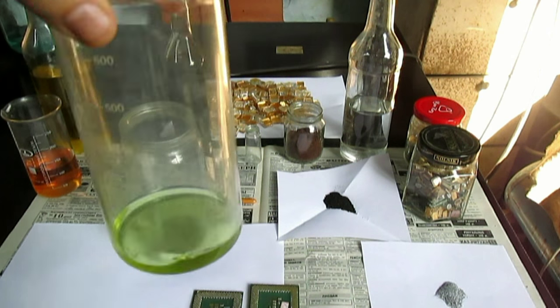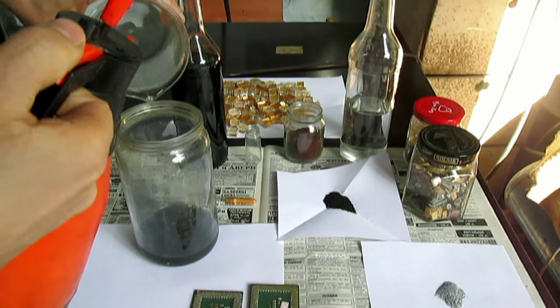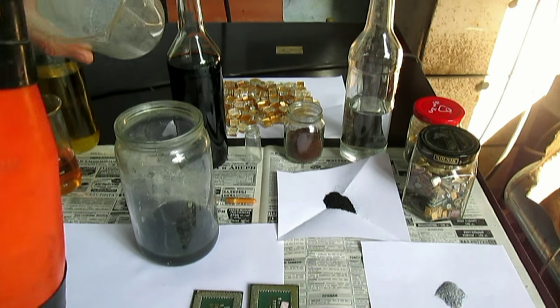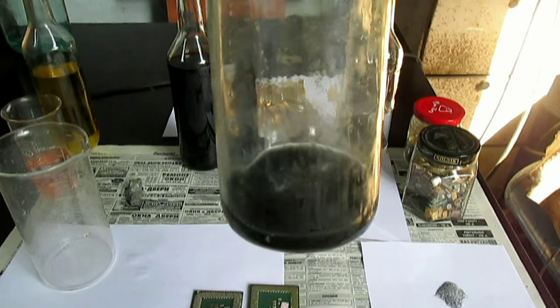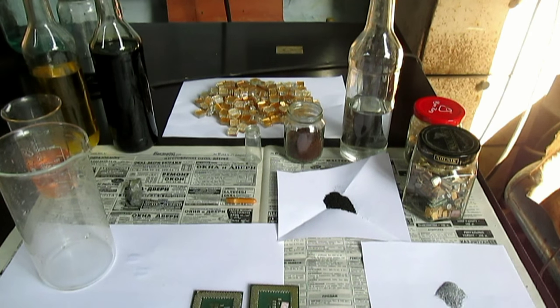Переливаем сюда раствор с золотом. Этот раствор я получил из посуды — в следующей серии вы об этом сможете посмотреть, что я делал. Там я применял суперреагент. Потом я это всё растворю, а сейчас мне нужен стаканчик просто. Убираю этот осадок с раствором золота в сторону, потом я буду это показывать. В этом видео я буду обозревать сам суперреагент, рассказывать его свойства, что с чем он реагирует.